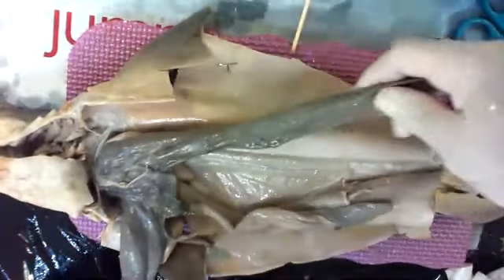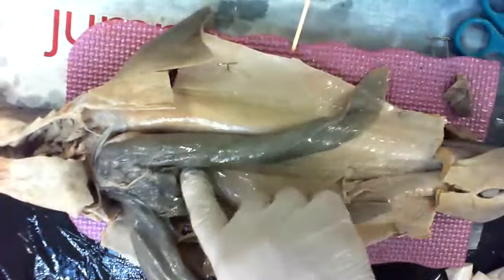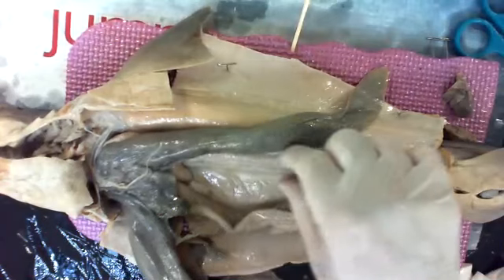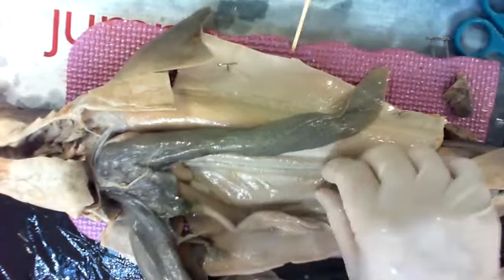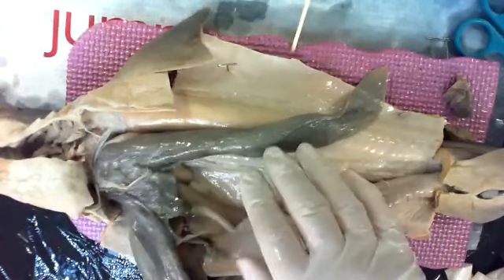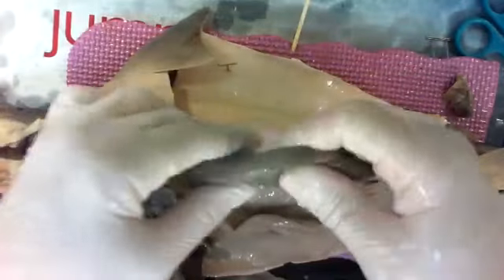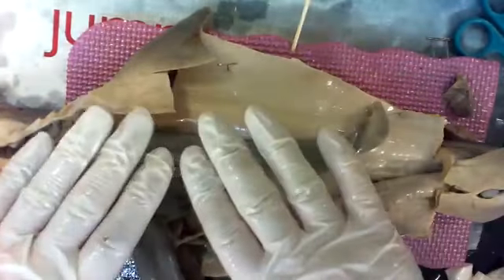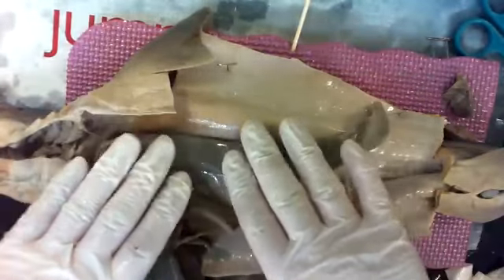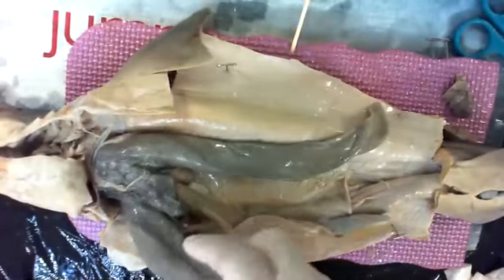In a shark, the liver stores oils because a shark can't float. I don't know if I mentioned that earlier. I don't think I did. Because in a normal fish, you'll see a big air sac through here. It's called a float bladder. And that air sac helps them float. Sharks don't have it. So if they stop swimming, they start dropping to the bottom. However, if they have enough oils in here, they'll kind of float. It's like water and oil. Oil floats on water, so it'll help the shark float a little bit. But if it stops, it's still going to sink.